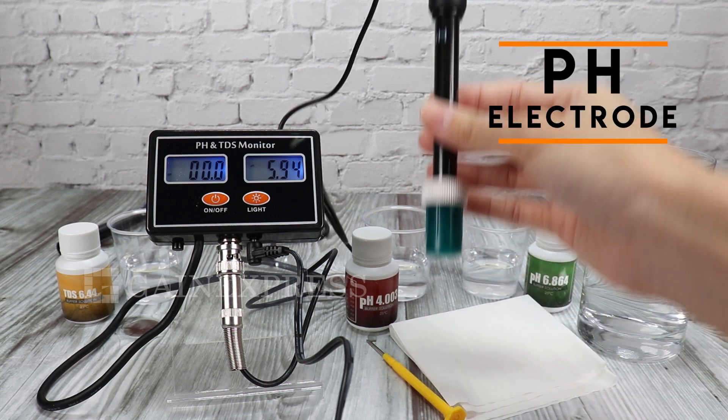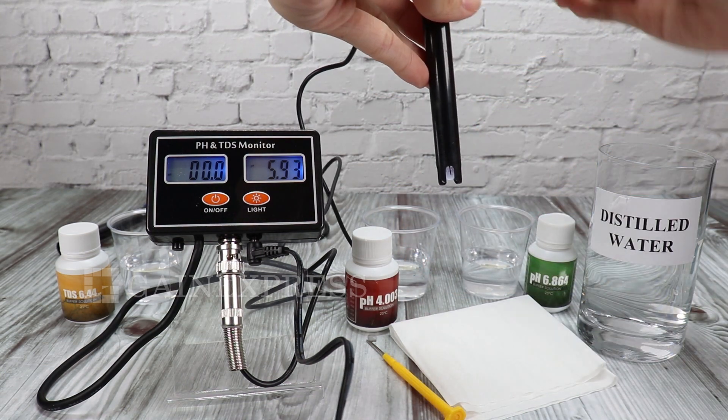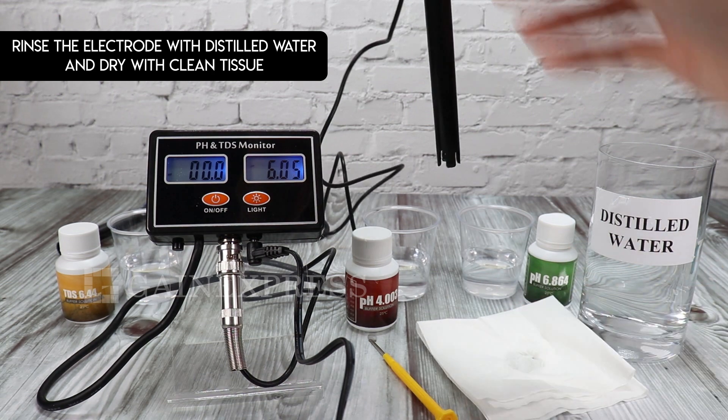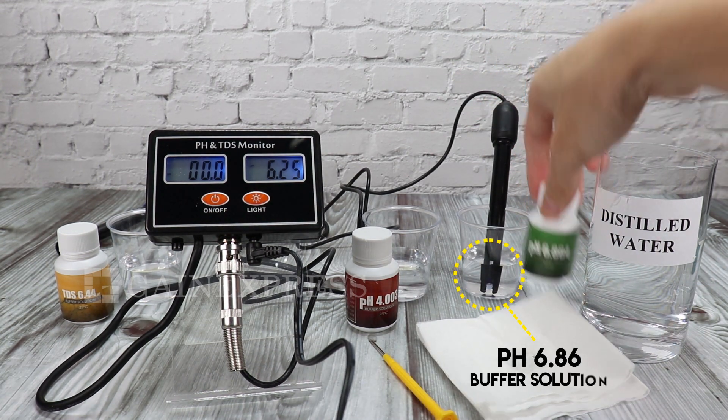To calibrate this meter, rinse first the pH electrode with distilled water and dry it with clean tissue. Now, immerse the pH electrode into the pH 6.86 solution.